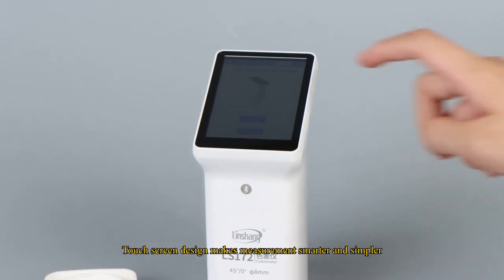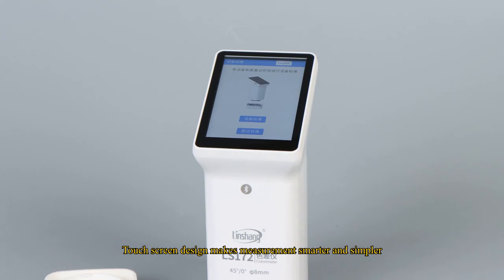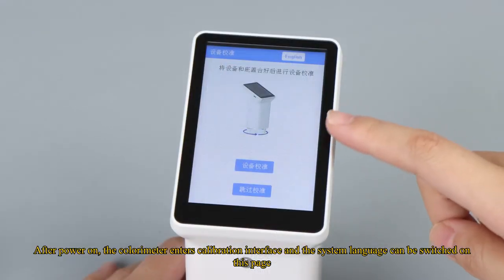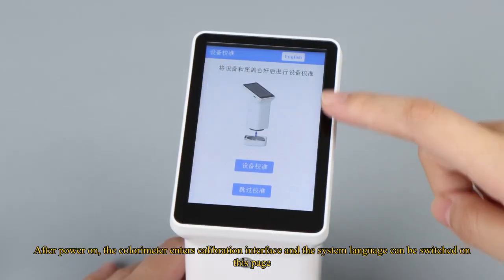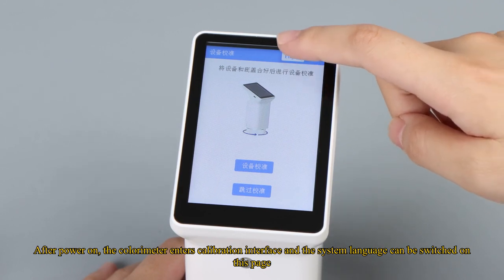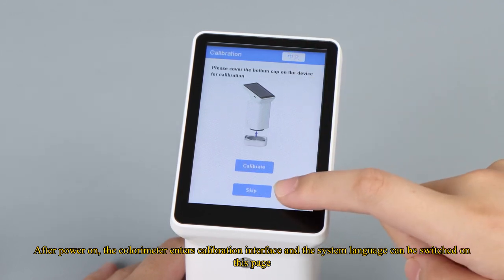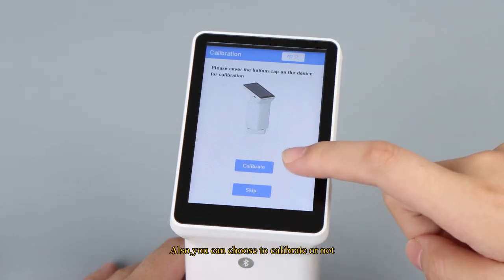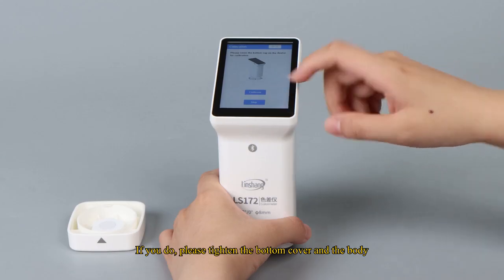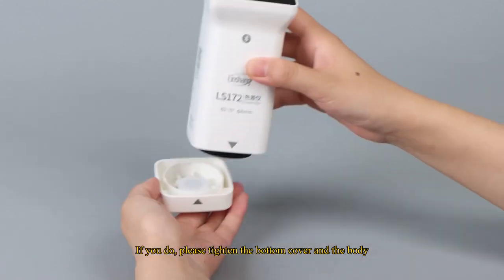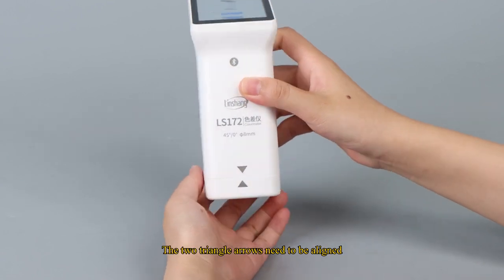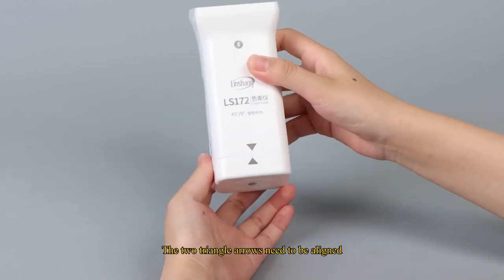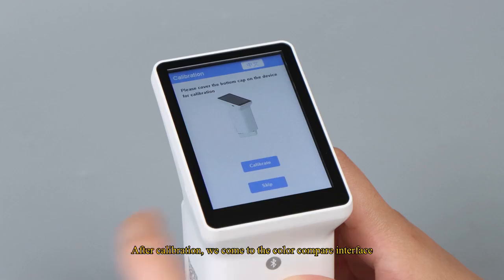Touchscreen design makes measurement smarter and simpler. After power on, the colorimeter enters calibration interface and the system language can be switched on this page. Also, you can choose to calibrate or not. If you do, please tighten the bottom cover and the body. The two triangle arrows need to be aligned.